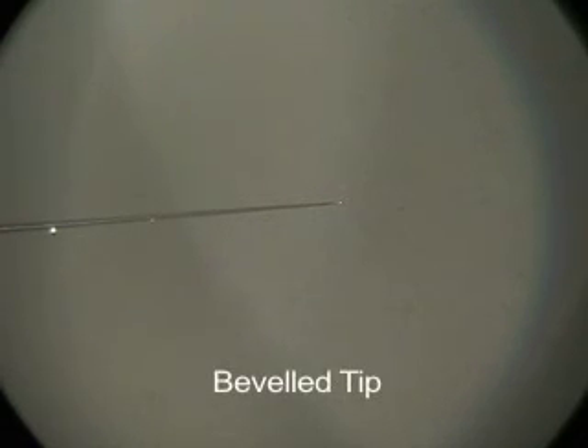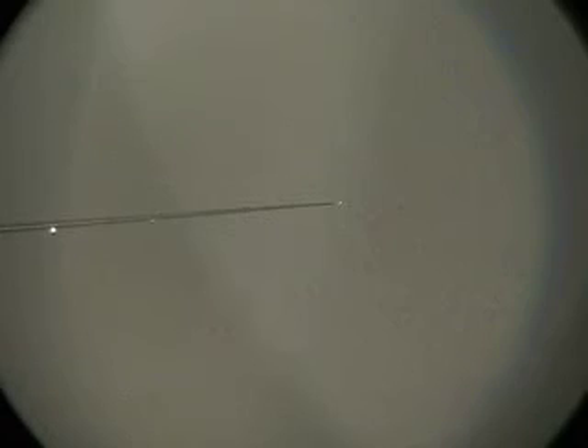You can see that the tip is shining. This means the needle is open and ready for microinjection. Remember, just the end of the tip has to be broken. If you make a big hole the needle is not good — the hole has to be very small.